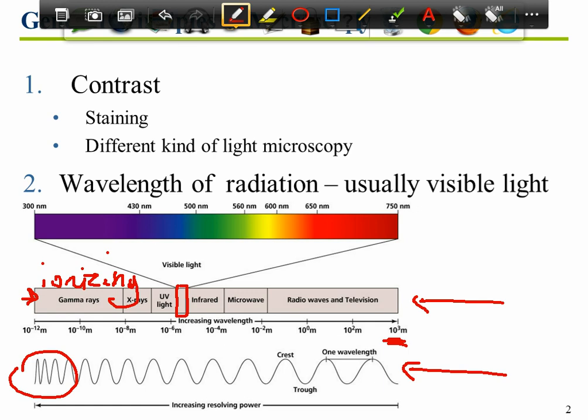So when you look at a lamp or you're looking up at the ceiling here and you see what appears to be white light, what you're seeing is a compilation of this whole area of the spectrum, which runs from 300 nanometers up to 750 nanometers. These are the colors of the rainbow, of a spectrum. You know them probably as Roy G. Biv. You learn those in grammar school. Red, orange, yellow, green, blue, indigo, violet. So going from right to left, you see those colors.